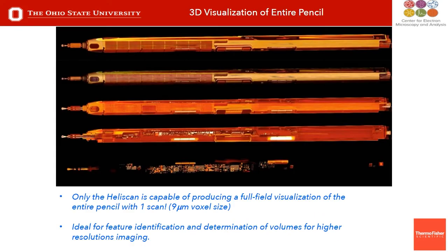So I just alluded to this, but with one scan, if we think back to the picture that was destructive from the CNET article, where you saw all the components laying on the table, now we can see all the various layers of this pen in these 5 different images. In the top 3, we're looking at different levels of the outer casing, the middle casing, and the inner casing.